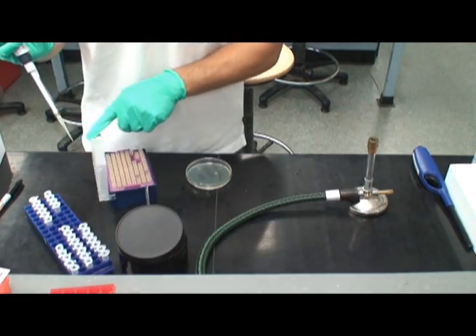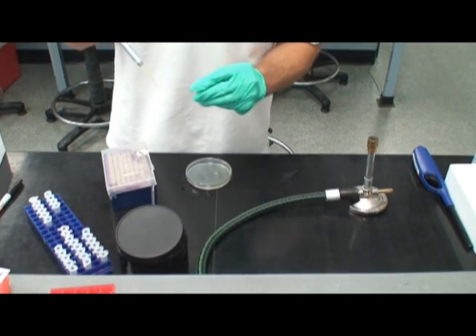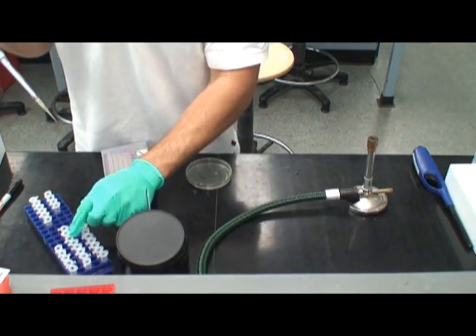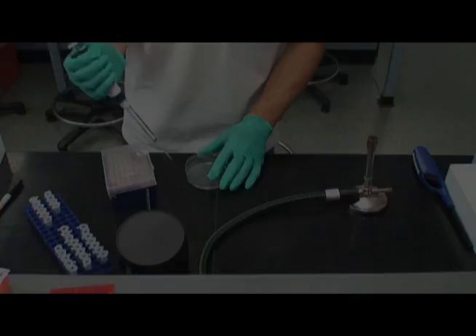To plate the dilutions, aseptically remove 0.1 milliliters from the tube using a micropipettor and a sterile tip and add to the associated dish.